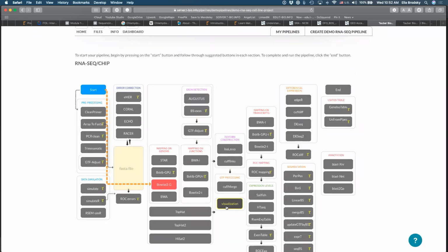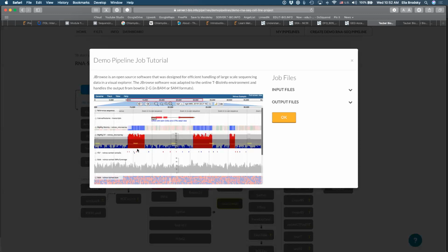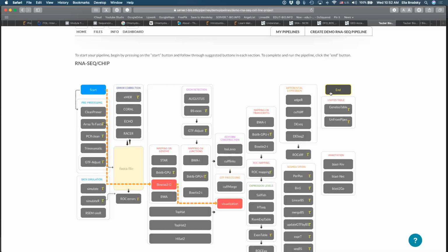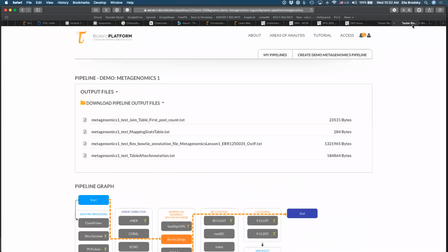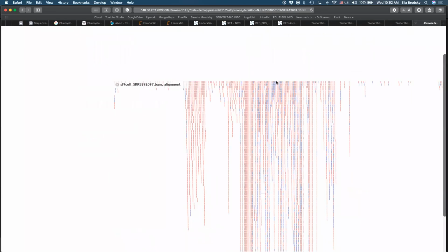And then after you have clicked there, you should be able to see visualization light up. And so what we'll do is we'll just visualize how the short reads map onto the reference genome. Okay, and at the end, press end. And once it is done, it should reload and you should have this button called visualization. So did everyone get there? Okay, if you have any problems loading this, please let me know. So if you click on this visualization button, this is what you should see.